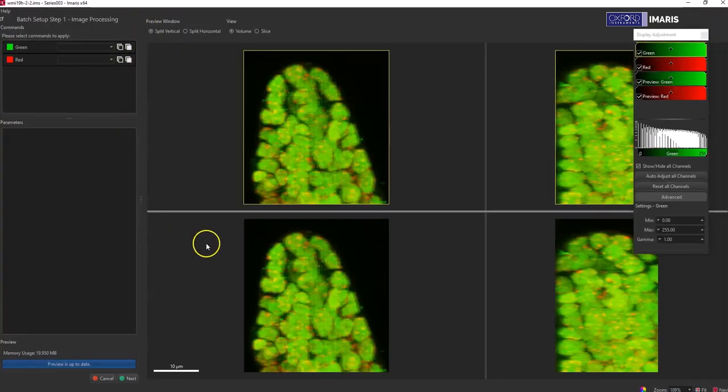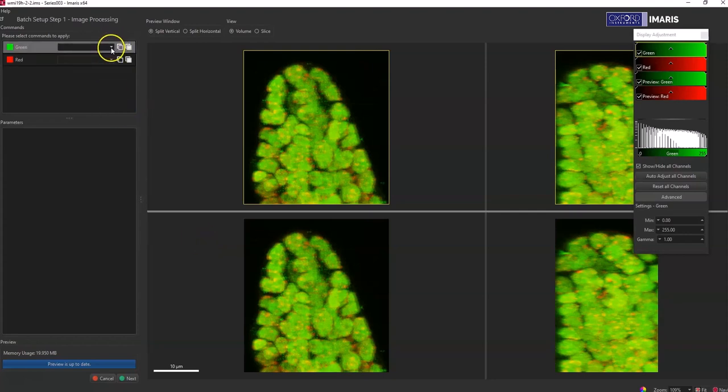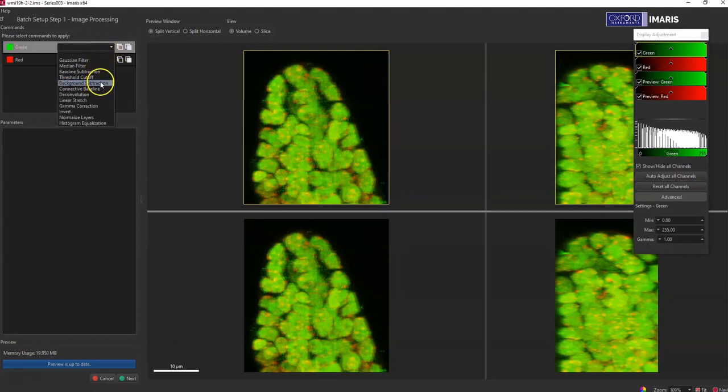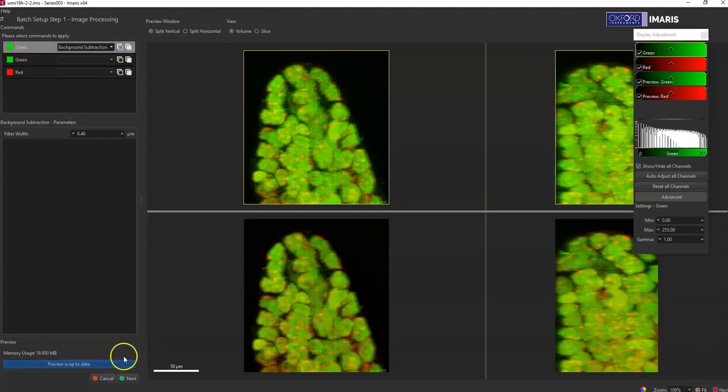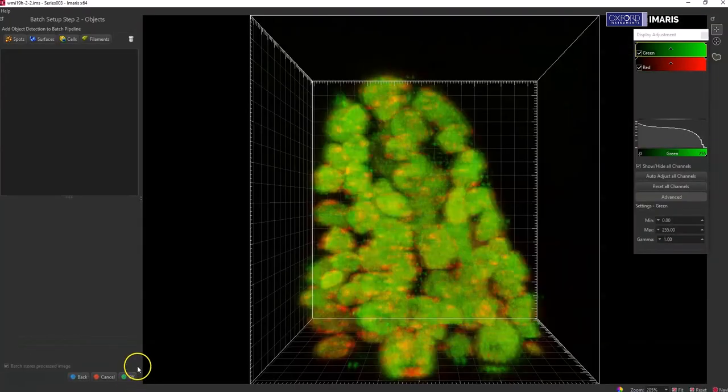Here you're only going to do the steps that are in addition to whatever that region of interest is. So if you wanted to do any image processing like a background subtraction or a Gaussian filter, you could do that here, and then you'll select OK or next.